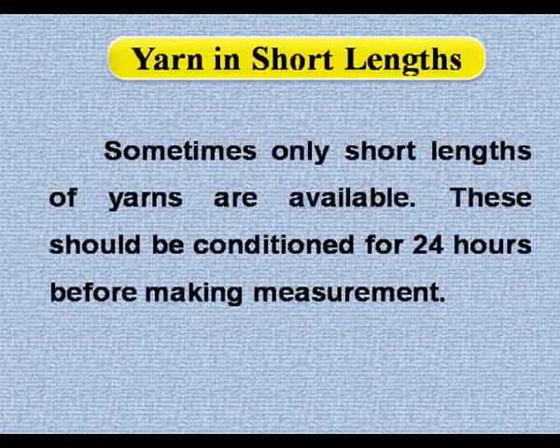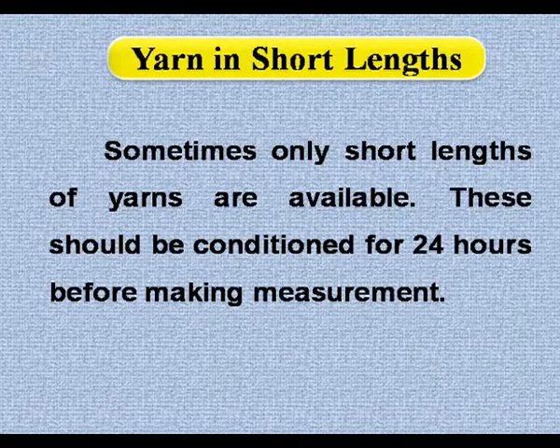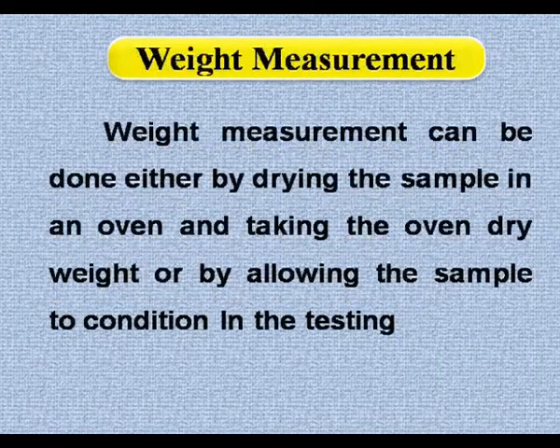Yarn in short lengths. Sometimes only short lengths of yarns are available. These should be conditioned for 24 hours before making measurement.